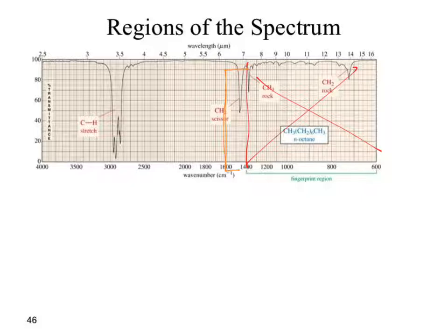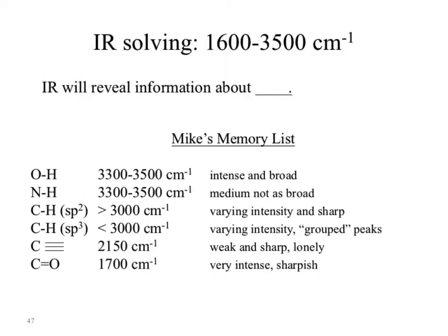Yes, there's a bunch of peaks there, right? I have a bunch of peaks piling in there. They're all representing the same thing, a CH stretch. How do I know all of those peaks are now grouped as the same thing? Experience, because I've looked at enough spectra, or I looked at that background file where it says the CH stretch looks like this with a bunch of peaks. You need to be reviewing that content as you move through this. Make sense?